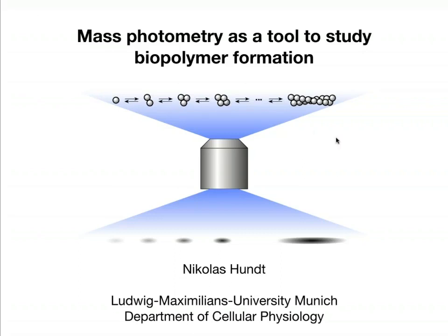And the lab had previously shown that it is possible with iSCAT to image individual proteins entirely label-free. So I was interested when I joined what new details we could reveal with this new technique on the actin polymerization process. And what I've seen, I want to share with you in this webinar.